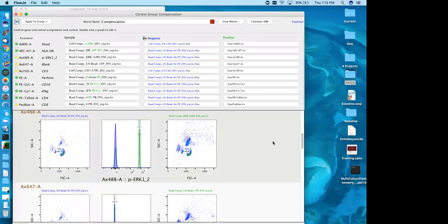And so if we scroll on here to the next one, Alexa 488, we can see that it looks like there's a nice bright peak on Alexa 488, so that looks fine. If we glance up at the name, we notice that this data set, which was collected by my colleague Tim, he didn't put the X when he named the samples. And so humans who are exquisitely good at pattern recognition will see A488 and AX488 and go, oh yeah, no problem. Alexa 488, a computer which is looking for an exact match, will give you this yellow light here. And so we'll notice that the three highlighted here are all AX values. And so that's going to explain why we've got yellow lights there. So the yellow light does not necessarily mean that there is something wrong. It just implies that this is something you should give a look at to make sure it's okay.